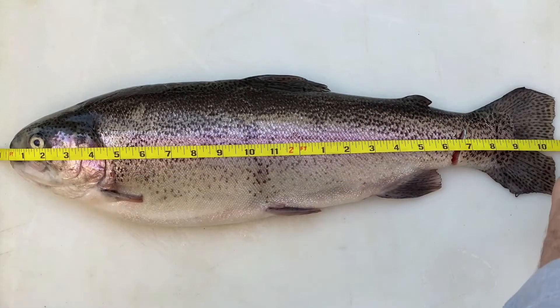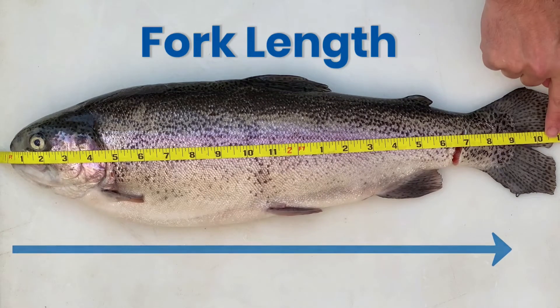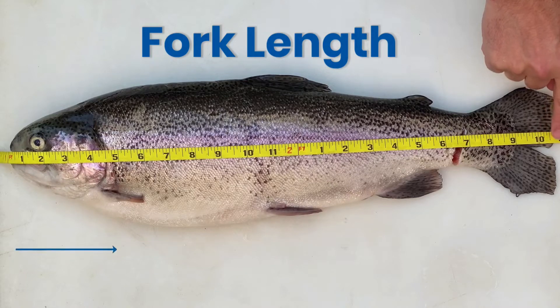Let's learn how to measure fish. We take the total length, fork length, or the standard length.